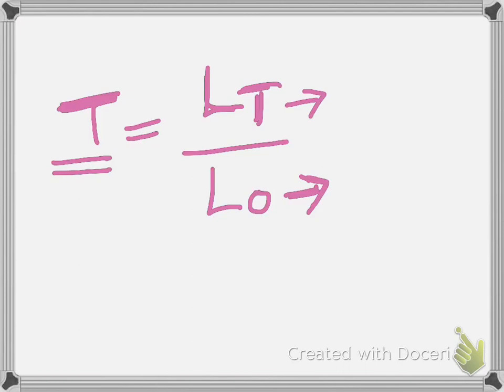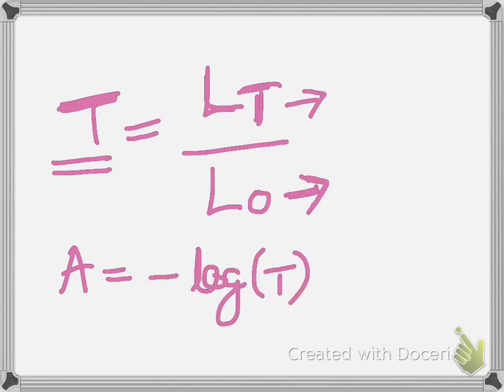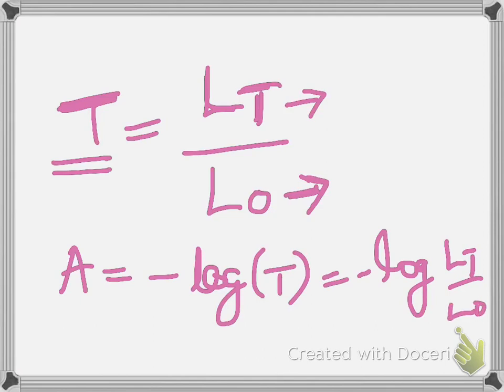The absorbance is related to the transmission by the formula A equals minus log T, that is, A equals minus log of I_T by I_0.